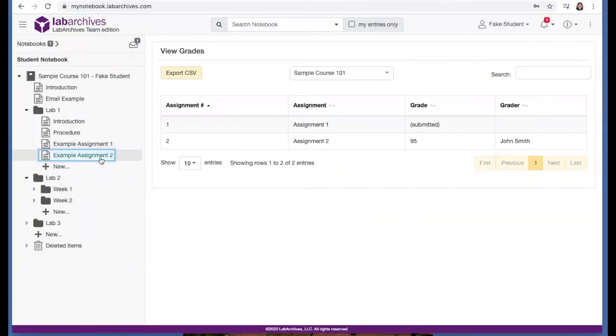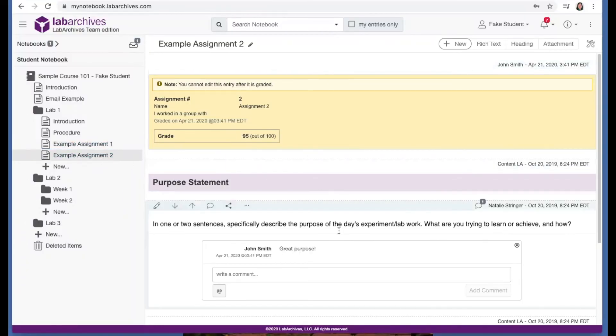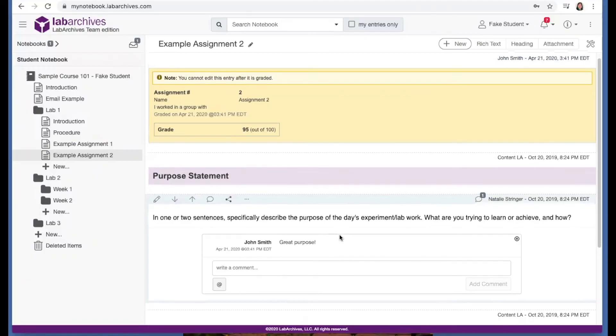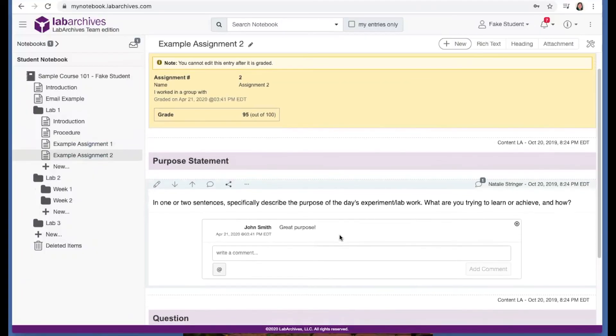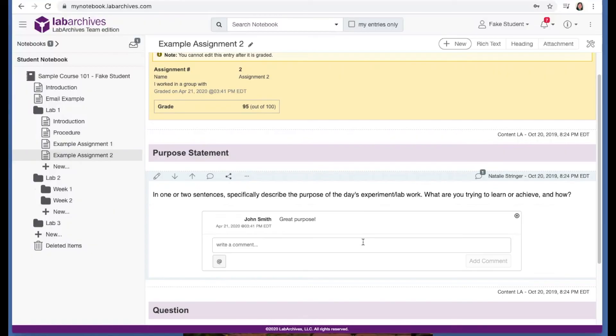And if you go to a graded page, you will see a grade in the assignment entry and any feedback or corrections that your instructor has added. If your instructor has added comments to an entry, you'll see them in the comments section, and you can reply to comments and mention your instructor to alert them.